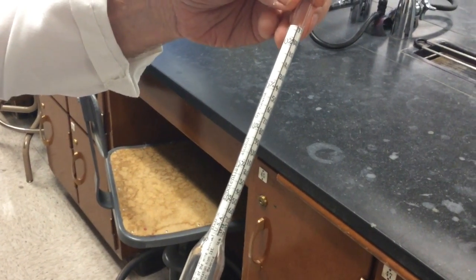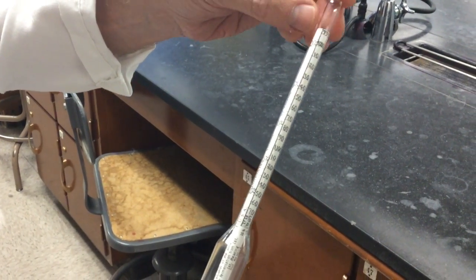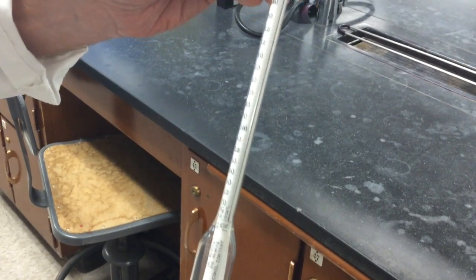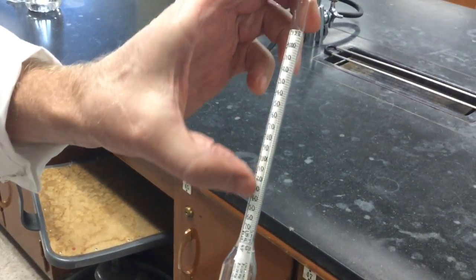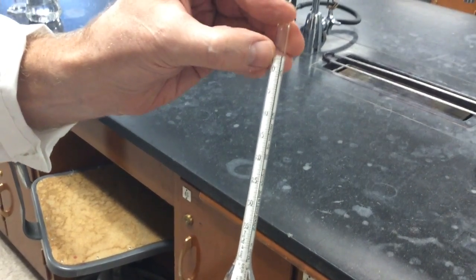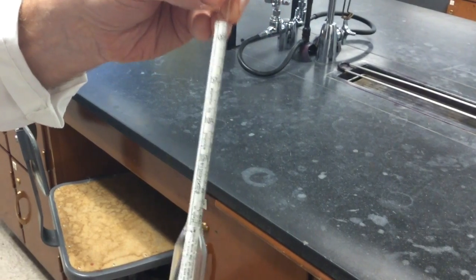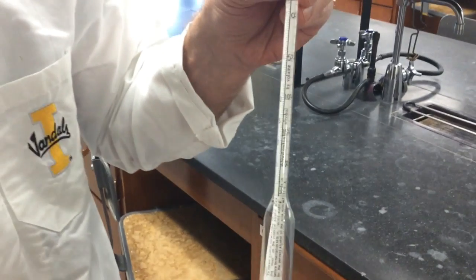There are three scales on here. We are only interested in one of them right now, but for your information, there is a percent scale called potential alcohol — that's what we want, and that's this one right here. Next to that is what this meter actually measures, which is specific gravity of water — that's that scale. And then the third scale is the balling or brix scale, which is basically a percent sugar in water. The balling scale and the potential alcohol scale are derived scales from the specific gravity scale.